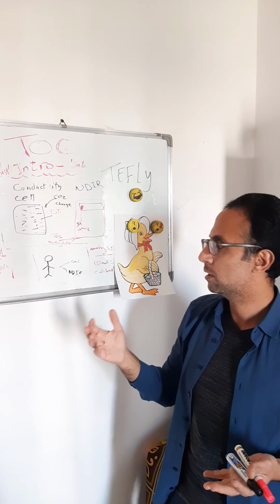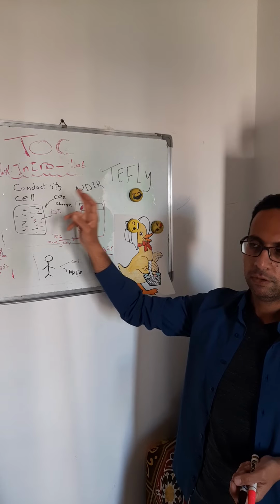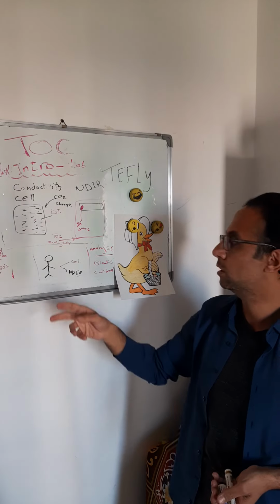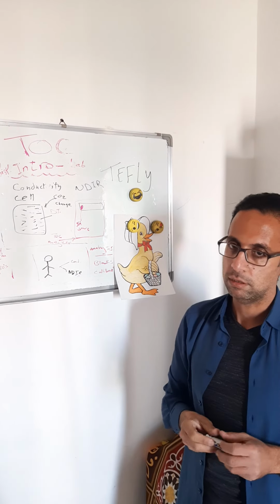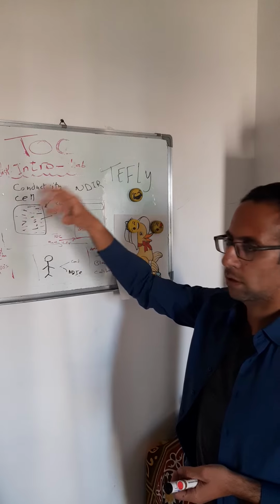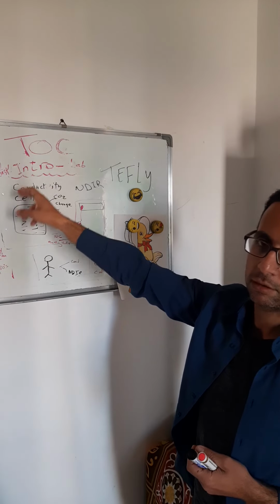From experience, I'm not recommending one type over the other, as both are great in detection, but I think the conductivity cell is very accurate for maybe low concentrations, although NDIR also measures low concentrations. But the conductivity cell is actually a very innovative technique. Here CO2 changes the conductivity of DI water. There are TOC analyzers that use a conductivity cell as a detector.